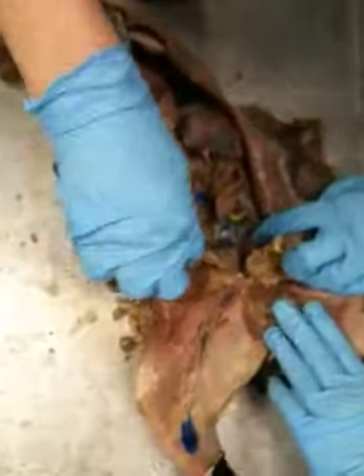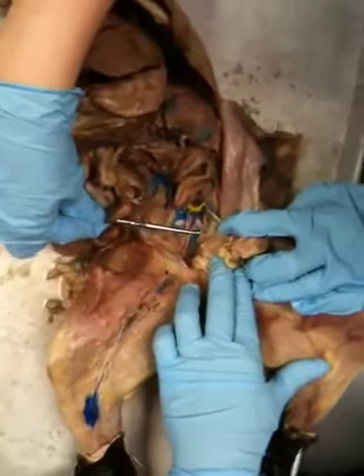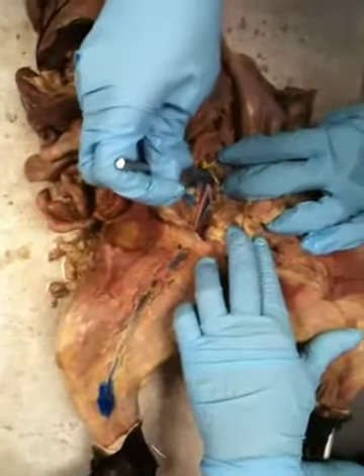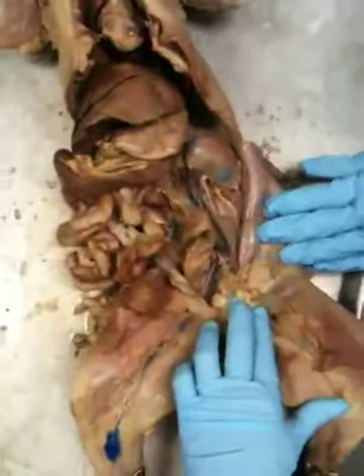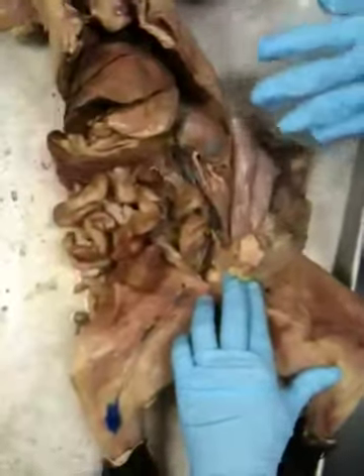Okay, so remember in the kitty you got a little different thing. Internal iliac's in the middle. That's weird, it's a little different there. And then it comes to the aorta there. Okay, so there's no comment on the kitty. Yeah, it's a different structure setup. So I probably won't tag right there because that's a little confusing.